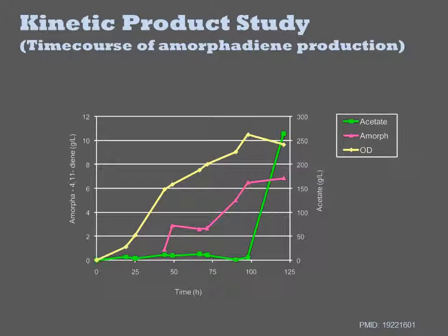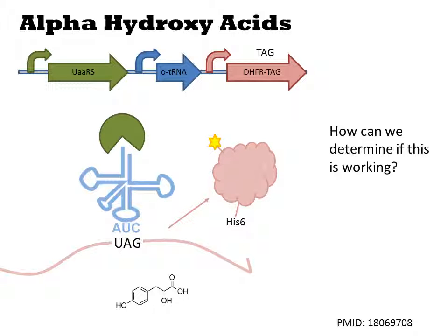Acetate accumulation is a common byproduct during fermentation and is one route by which carbon can be lost during conversion from glucose. Minimizing this loss is often the goal of these projects. So when dealing with microbial chemical factory apps involving small molecules, the scope of analytical techniques you need to consider is fairly straightforward. When you diverge from the small molecule apps, things get more complicated.